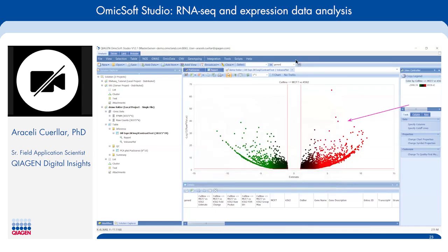And so you can see here now we have a volcano, where you can see the red is upregulated and then the green represents downregulated, which is represented here by this range. You can always adjust the coloring of the volcano plot by just simply right-clicking on the range to change the color.